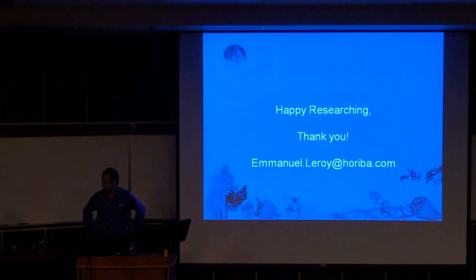Any questions? I have a quick question, and I would like the speakers that follow to talk a little bit about AFM and some of the tracking techniques later. This notion of using the tip as an antenna or as a detector, in essence, as a way of getting to the nanoscale. This is one particular example of that, but I've seen strategies where people are using, for example, IR radiation, using the heat generated at the tip as a way of getting high spatial resolution. I'm just thinking a little bit about some of these tips there are on the market.